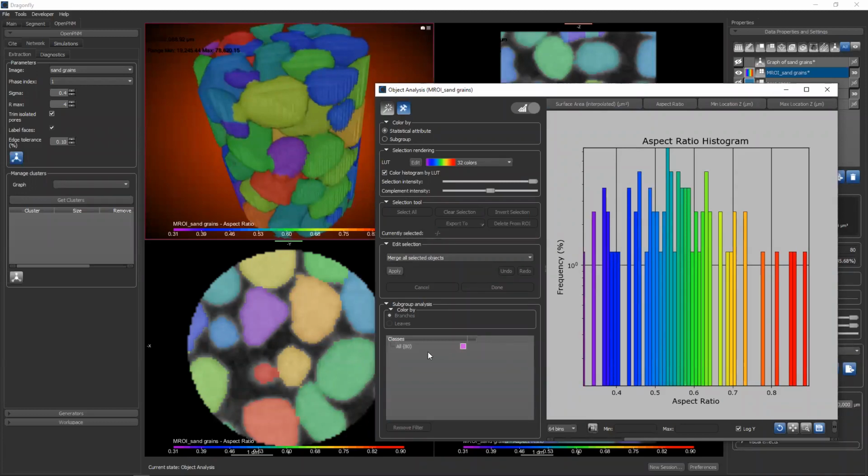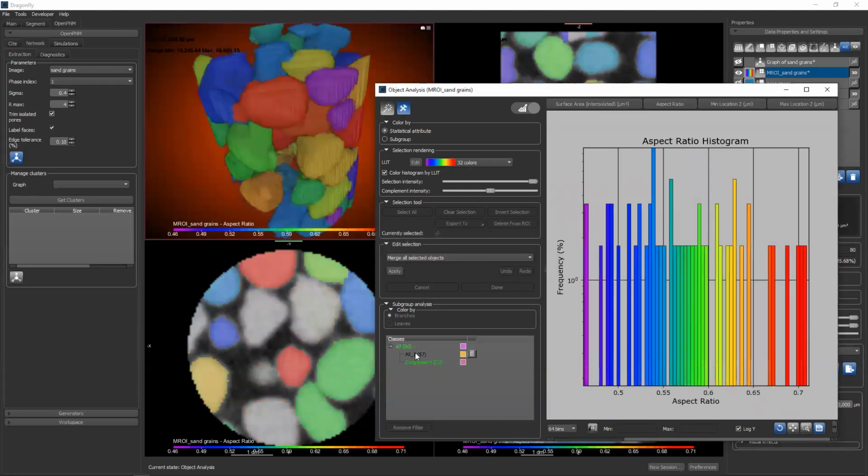And you can really dig down into these. Maybe I should get into that for just a minute. I could click this button, create the filter like we just did, and then I could dive into this, and then I could further sort by volume if I wanted. I do need to make my screen a little bit wider.